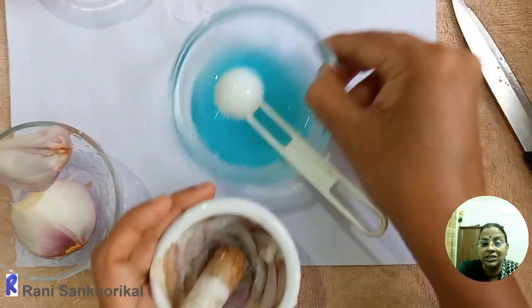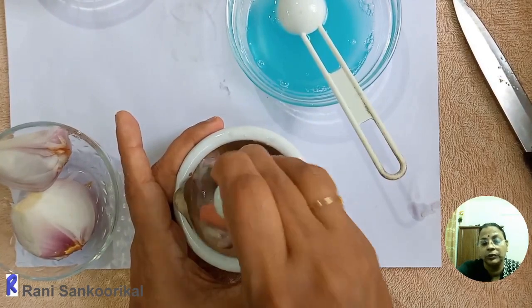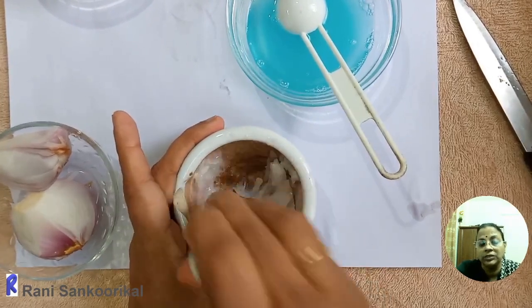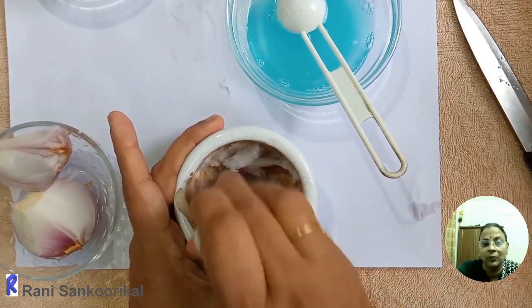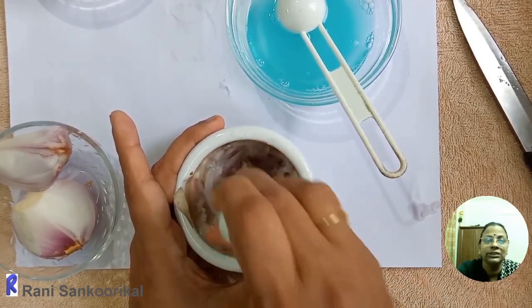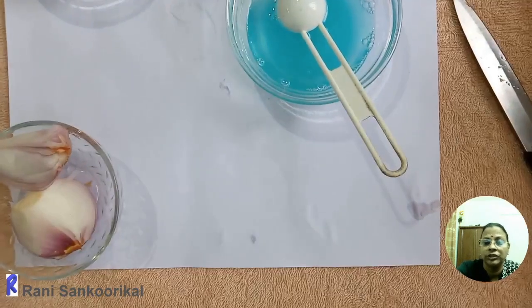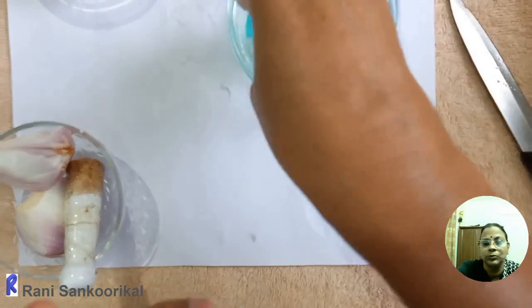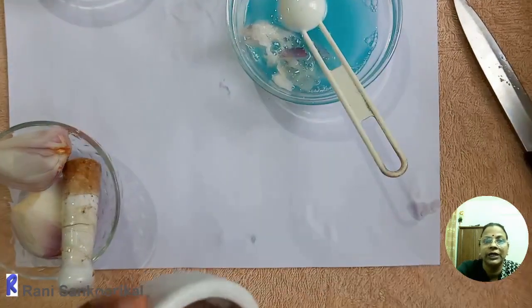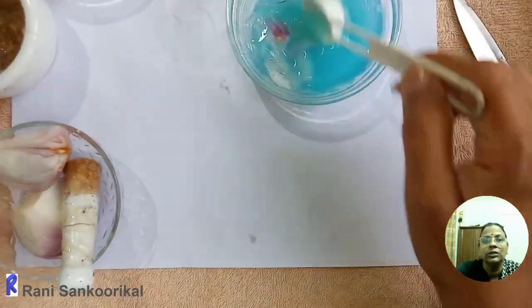After making the solution, detergent plus sodium chloride plus water, to that solution the finely crushed onion is added. So that's why, here it is not crushed properly, so again I am crushing it, making sure that at least the majority of the plant material, that is onion, is crushed and ground into a smoothie substance. That crushed material is to be added to the solution.